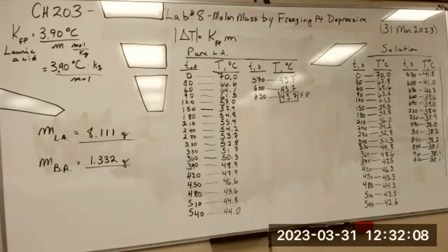So that's it for today. Yeah, I like that ending of the acid part, where it froze, like the freezing point. Oh, the temperature went up. Yes, the temperature. Yeah, that's interesting. It's not what you'd expect. It's called the latent heat of fusion.